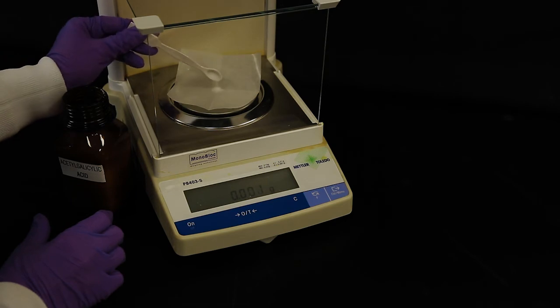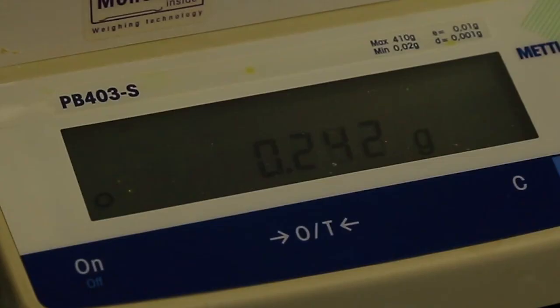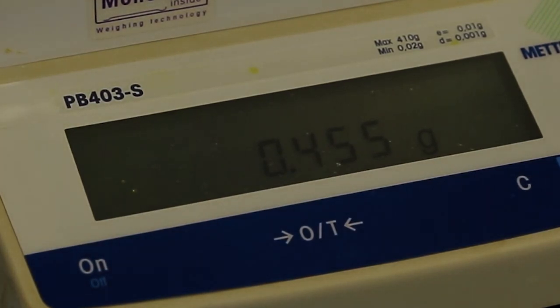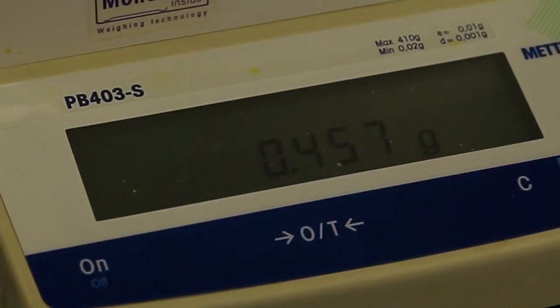When you have placed the desired amount of chemical on the weighing paper and the scale has consistently stayed at one number, record this weight and continue your experiment.